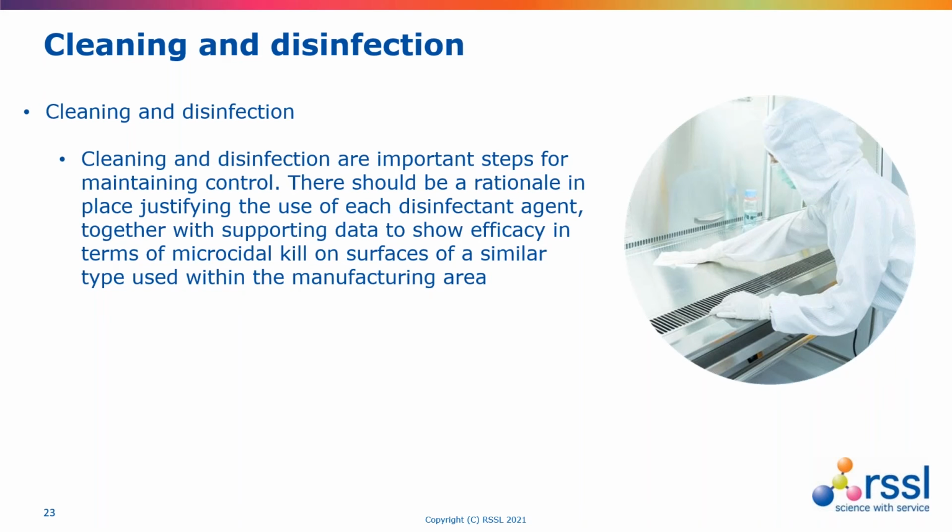And that's generally to the extent that they are visually clean. And a good detergent works well because it penetrates this soiling, reduces the surface tension, and allows it to detach from the surface, and then allows it to be removed.